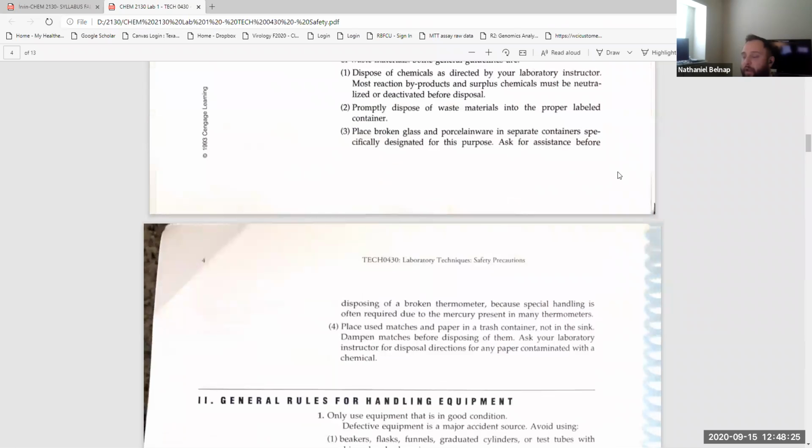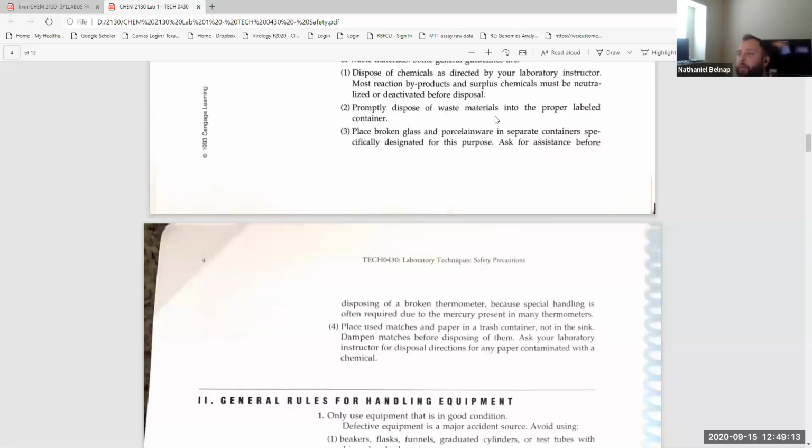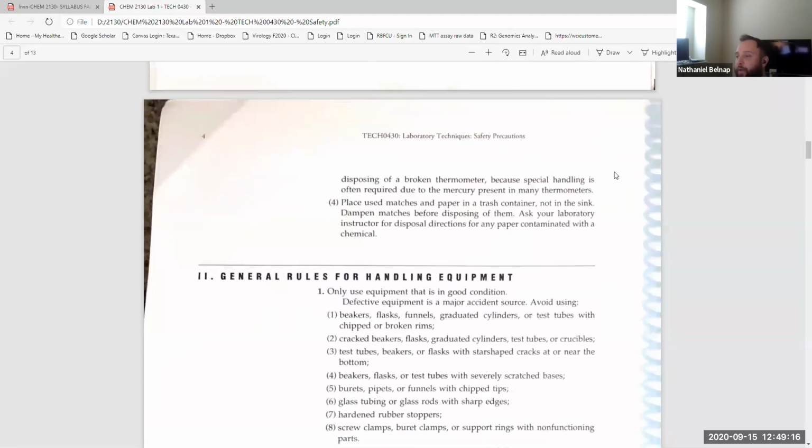And if we ever come across broken glass, what do we do with that glass? Do we just pick it up with our hands? Anyone can answer. Sweep up. Okay, I need other people to start answering. Whoever's answering, what's your name? Sean. John. Notify the instructor. Okay, yep, notify the instructor. Actually, no one should be sweeping it up other than the instructor.